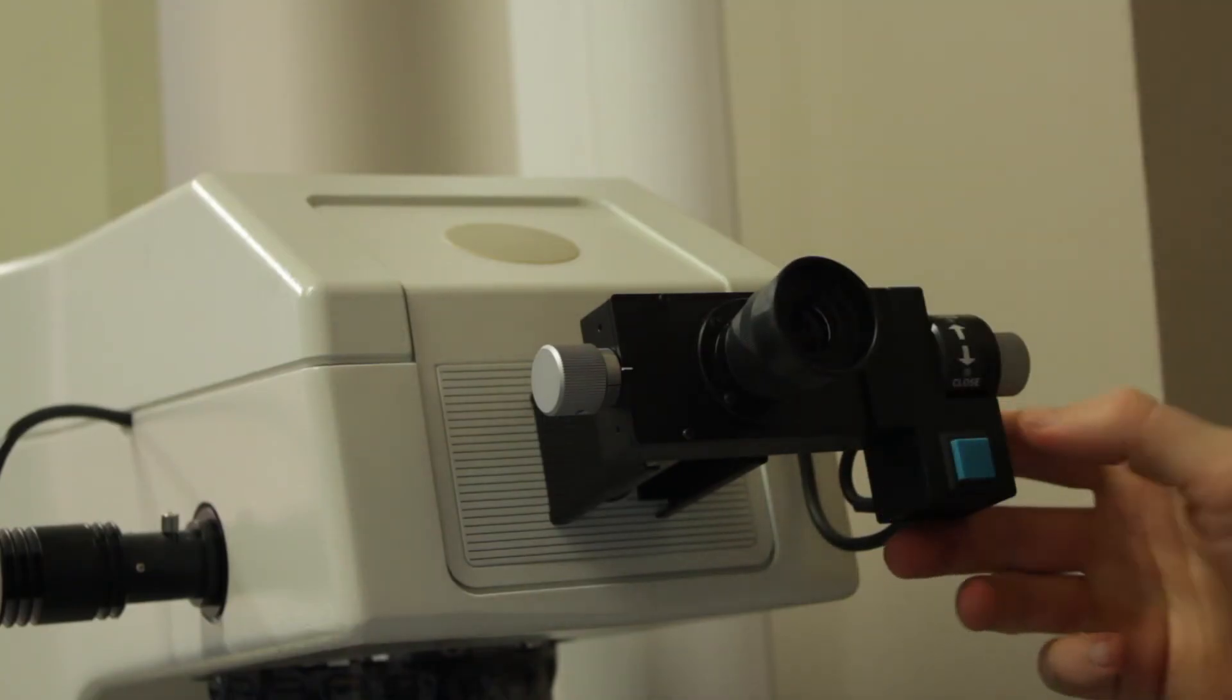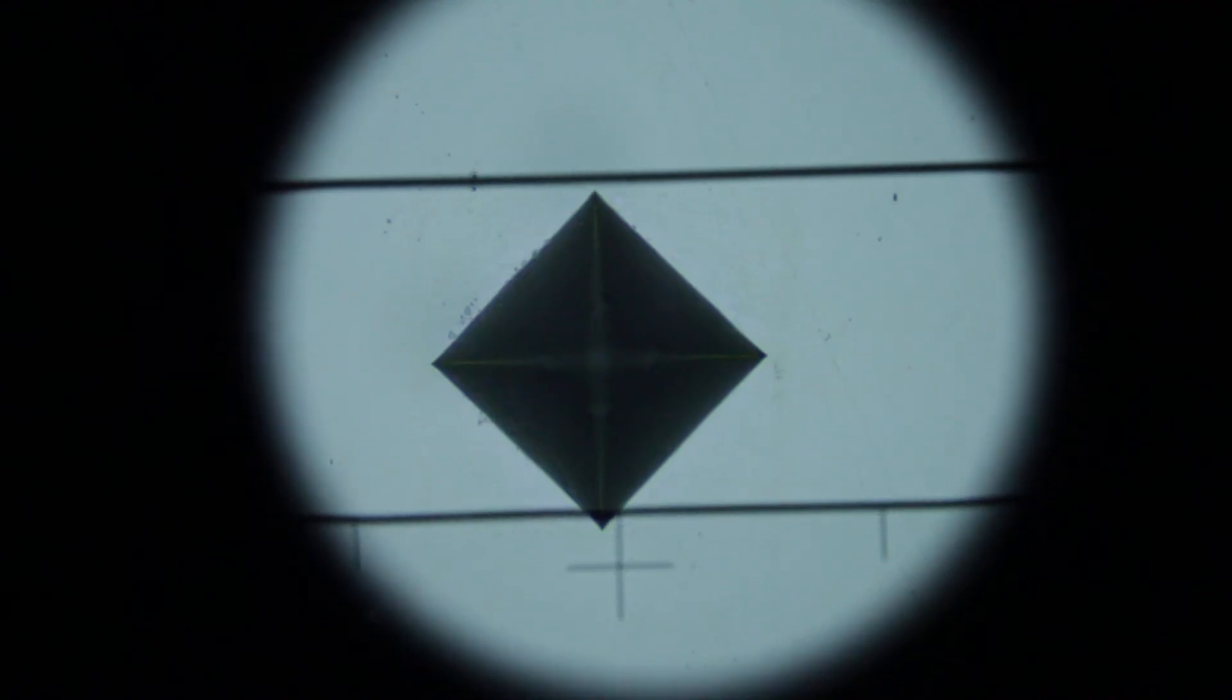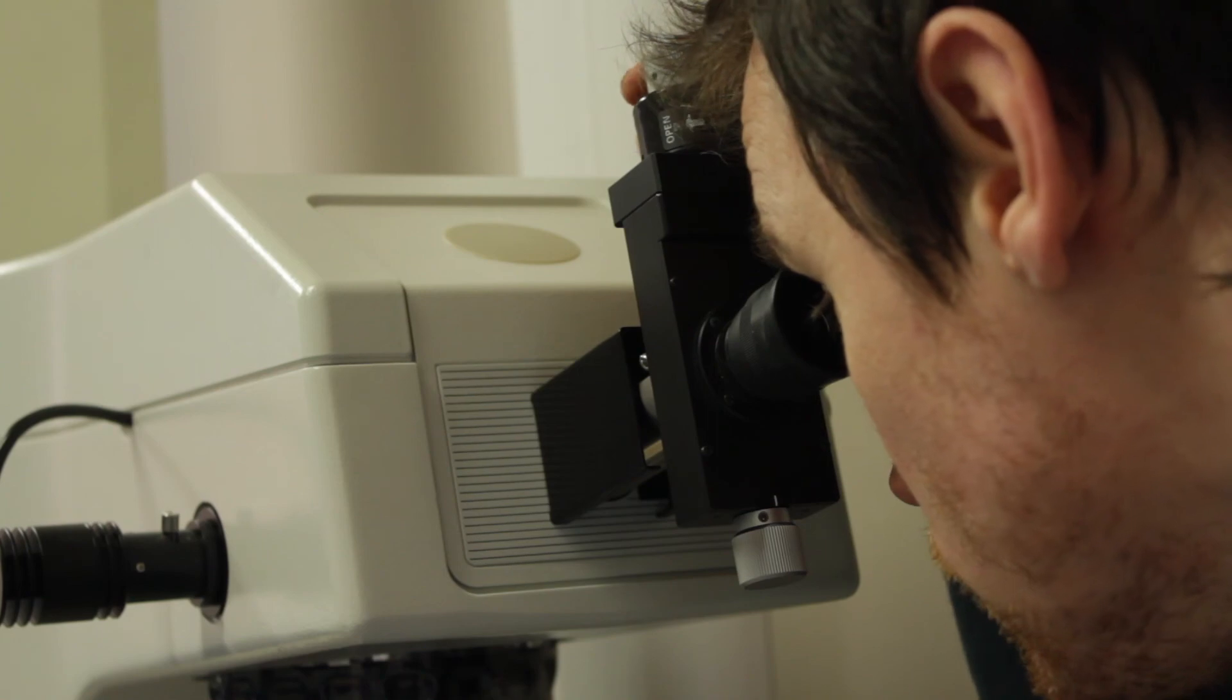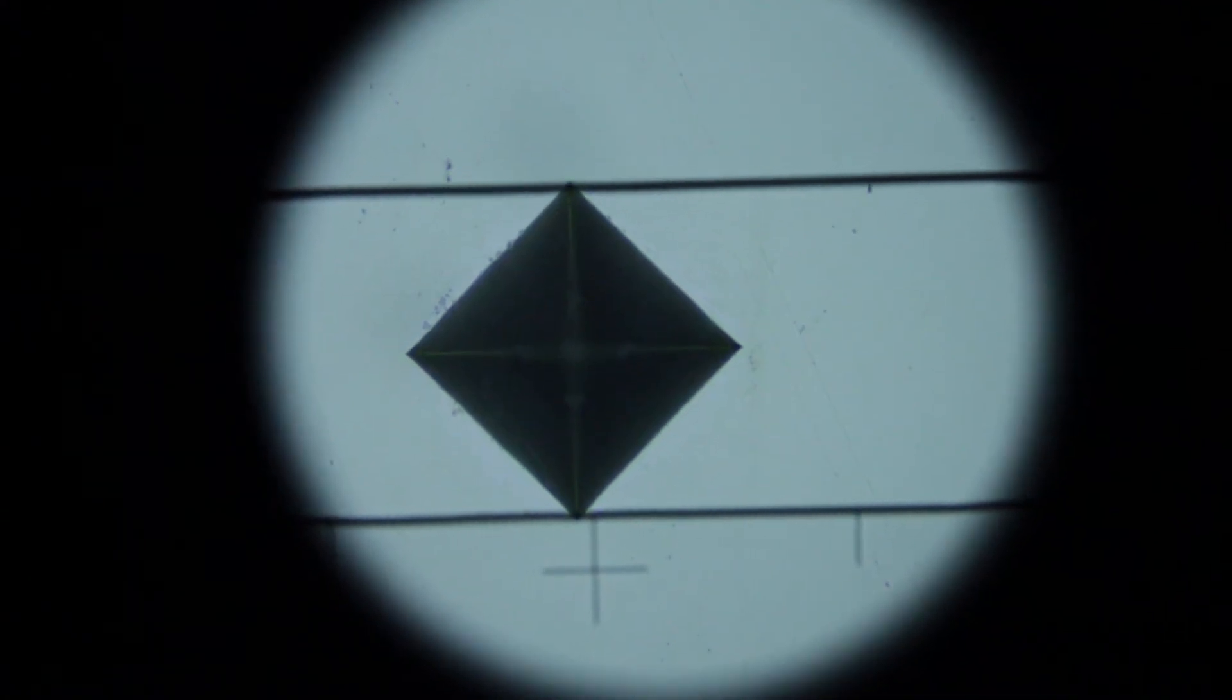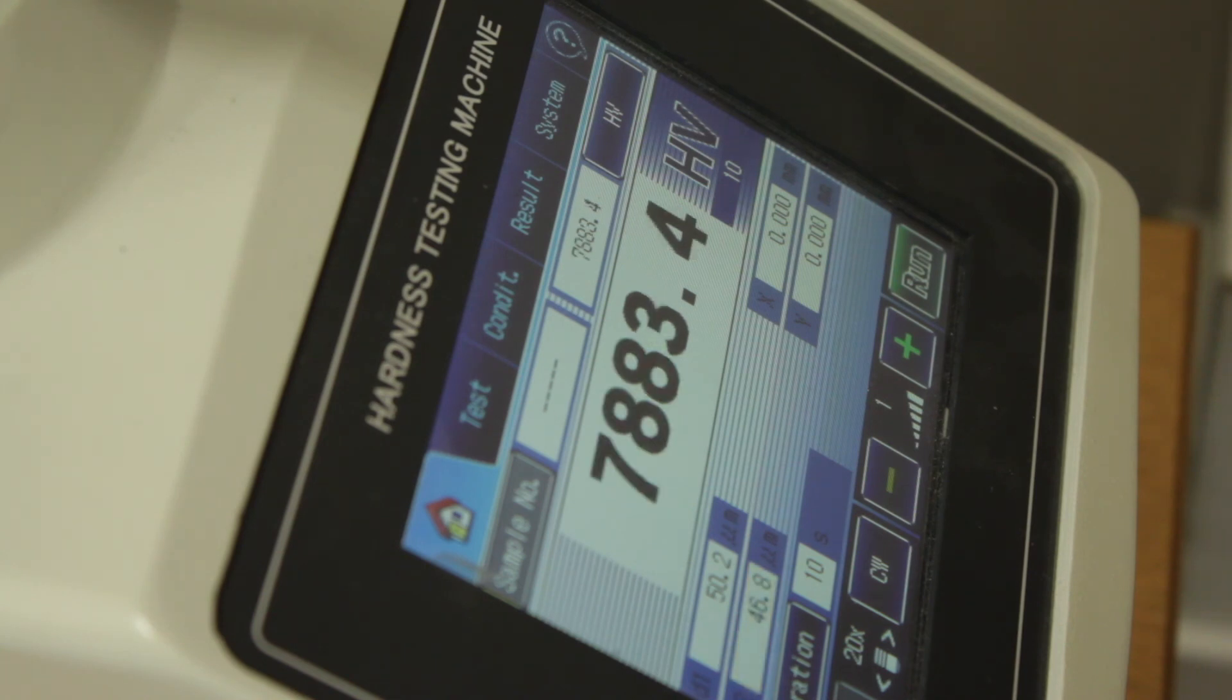When you've completed this, press the blue button and index the viewport through 90 degrees. Now complete the same process, but first adjusting the bottom line in parallel, and then using the top knob to adjust the top line so that it touches the top. When complete, press the blue button and this will yield a readout in HV.